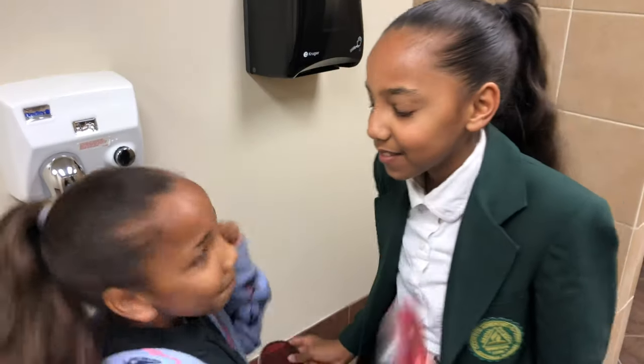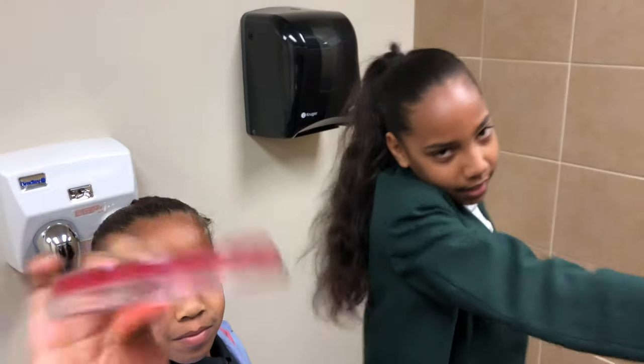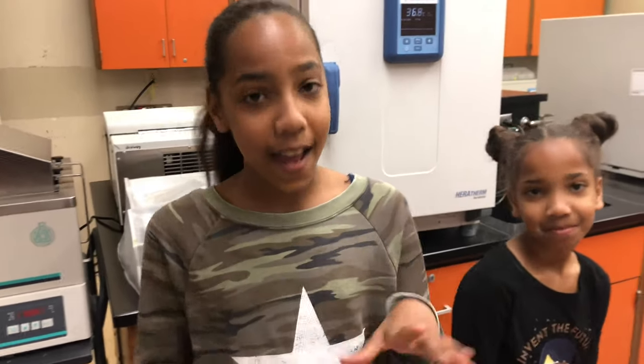Now we're going to incubate it to get the result. We're incubating it because bacteria grow better in heat. We'll be back tomorrow to show you guys the results.